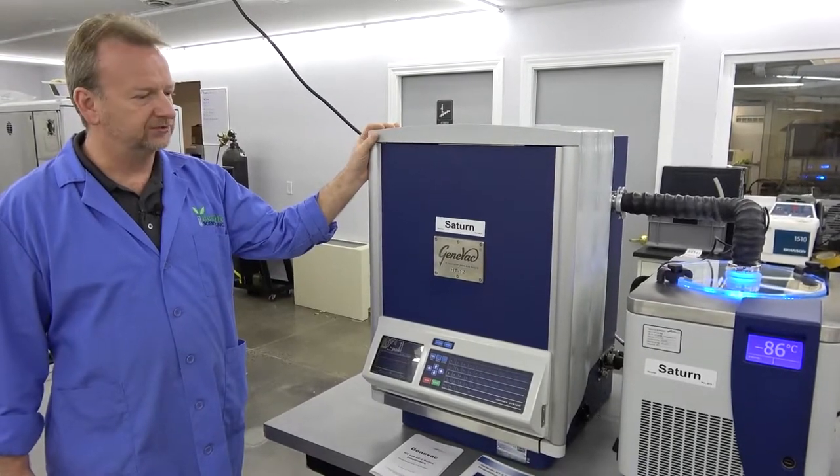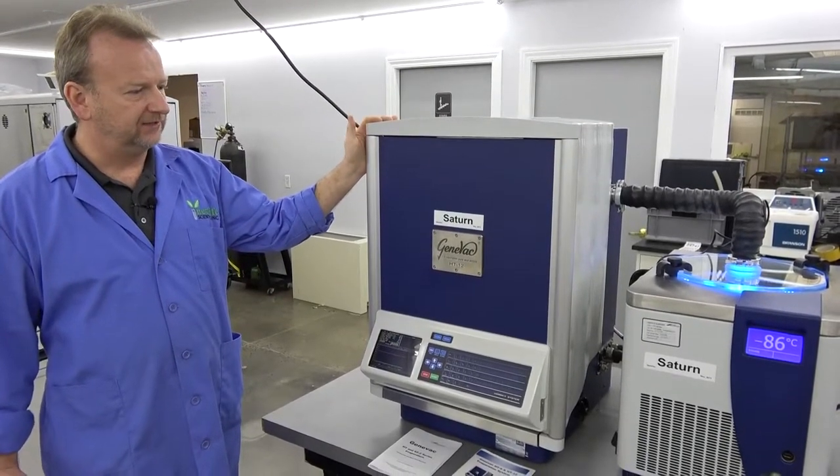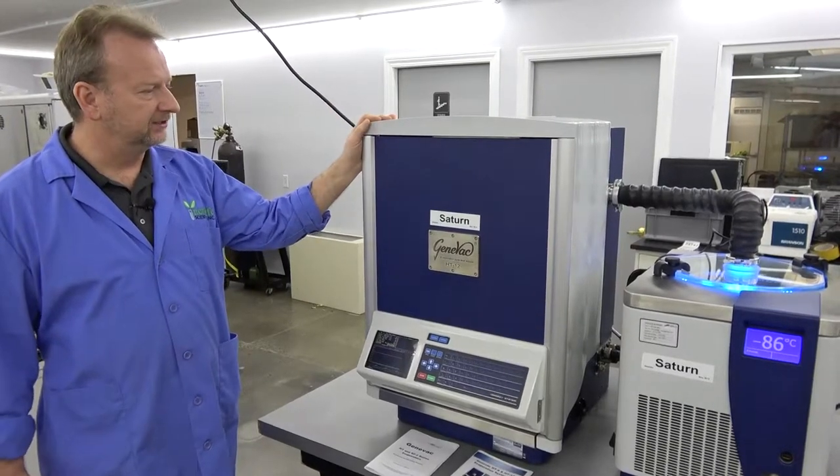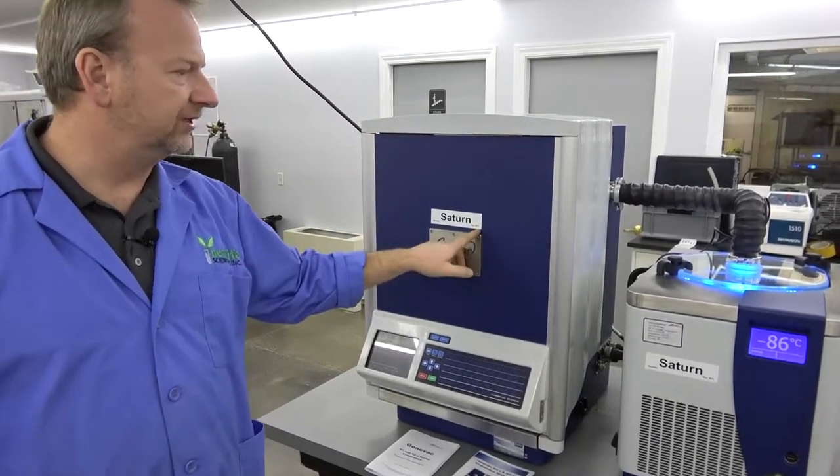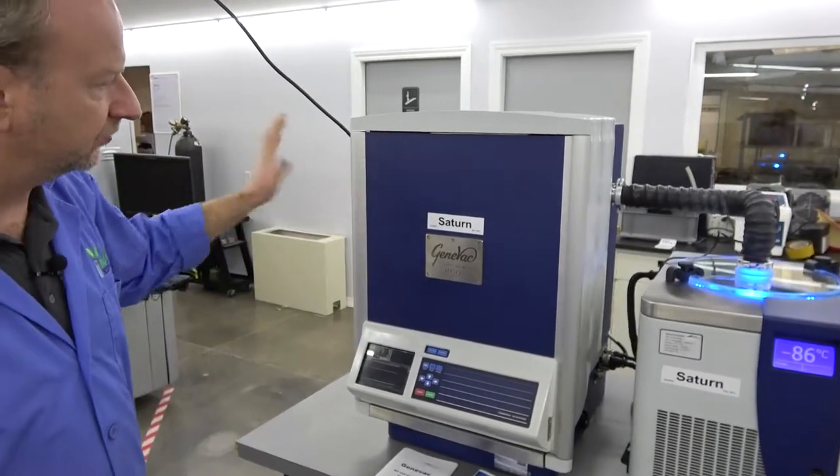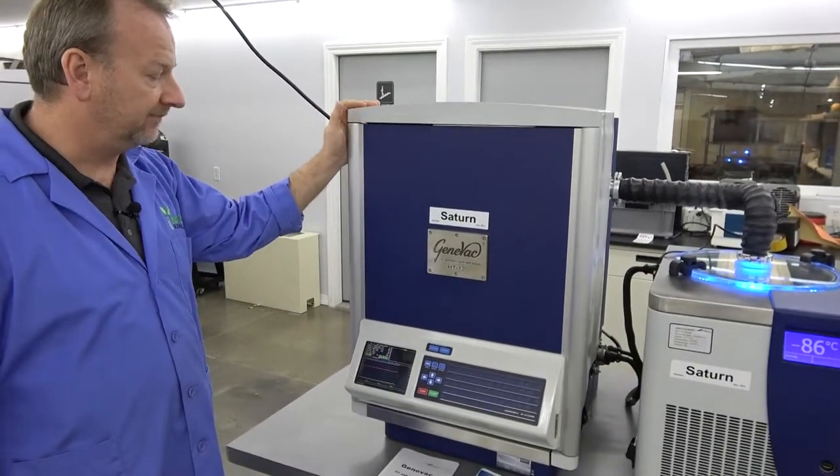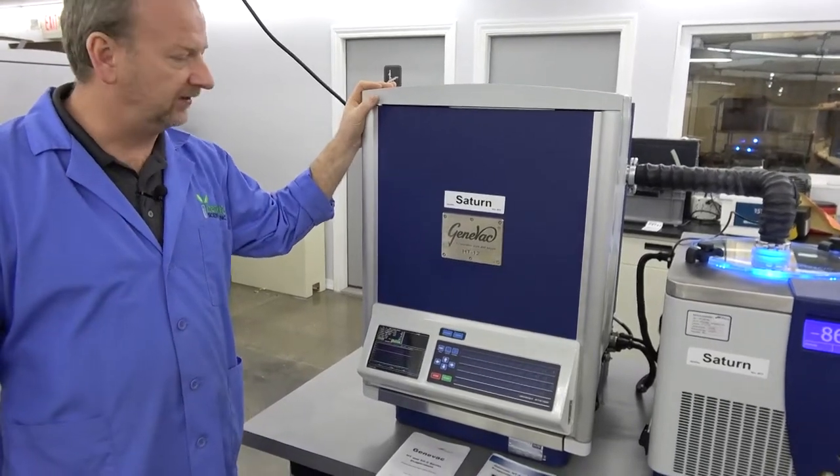It shows very little use as far as scuffing and spillage, but you can see that it is a 2013 model. It has the Saturn stickers on, which I'm not real sure what that means, but I'm going to call the company and find out.